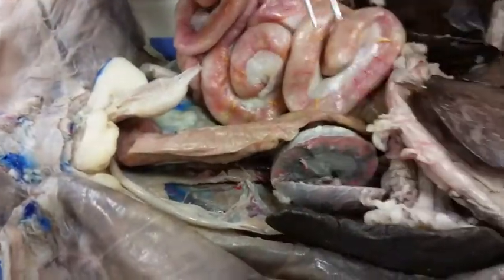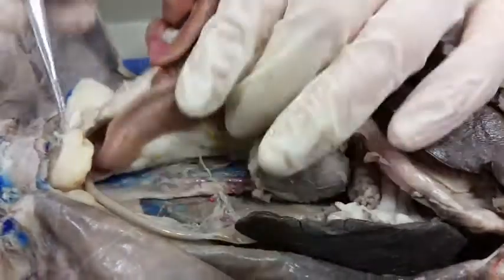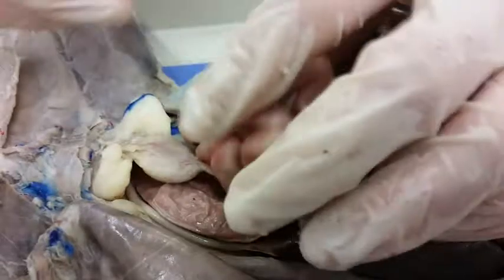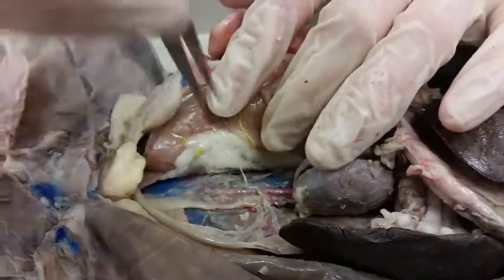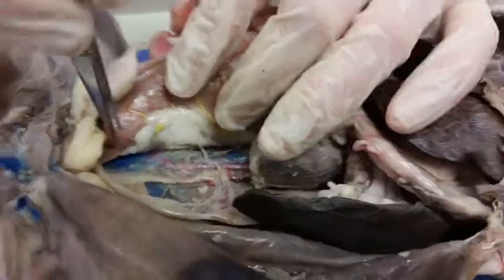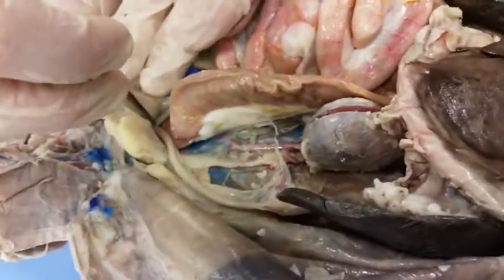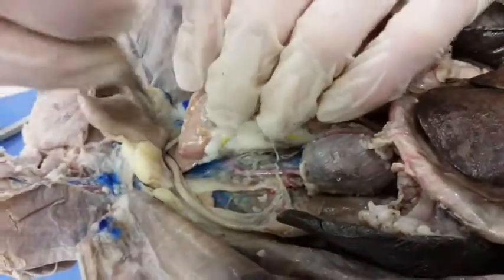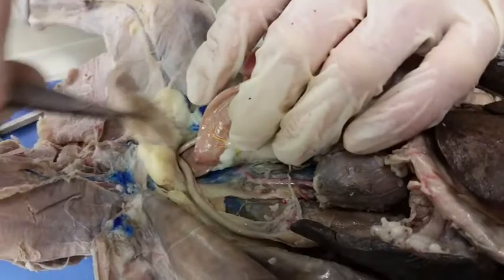and then we have the uterine horn. There's one on either side. So, uterine horn, which leads down into this beginning part right here, which is the cervix. Up here is urinary bladder once more.